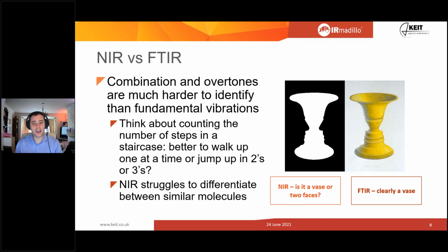And then linoleic and oleic acids, again, NIR will probably do a reasonable job of telling you there's a double bond there. But if you wanted to start looking at cis and trans acid, unsaturated acids, it wouldn't be able to tell that difference, whereas FTIR would. So it's that kind of difference that we talk about.